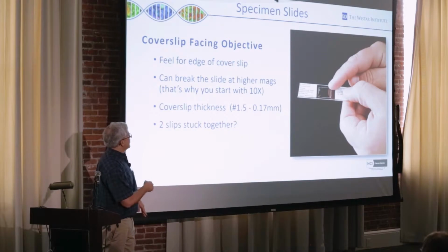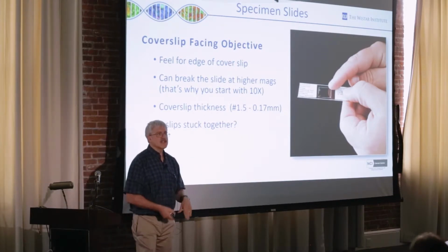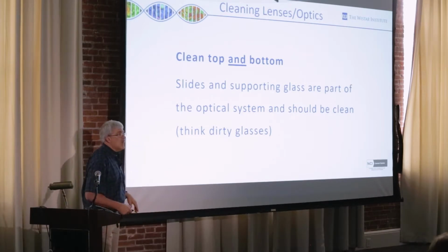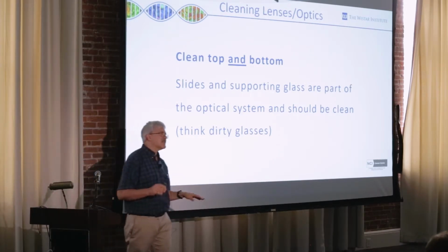Yeah, I've run into issues where people have had two cover slips stuck together. That creates problems too, but we'll just move on. That's a special case. All right, clean. Everything's got to be clean.